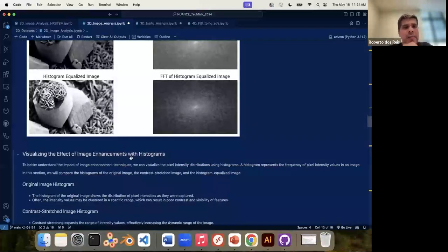And that happens a lot, especially if you have shadows on the image, like on SEM, for example, or on a TEM, where you have a not very parallel beam in the measurement, or in your STEM image at a lower mag. That happens a lot too, because of the way the beam scans across the sample. So that's why this one might probably be the most popular in this case.